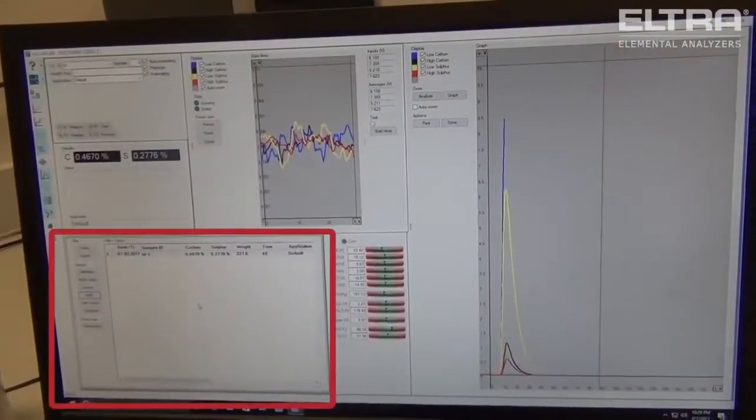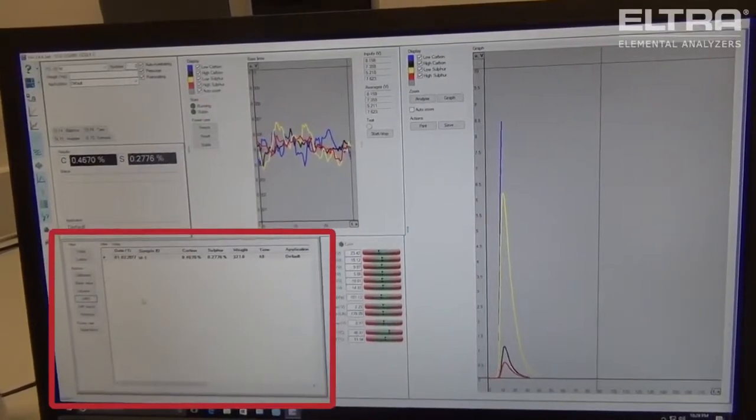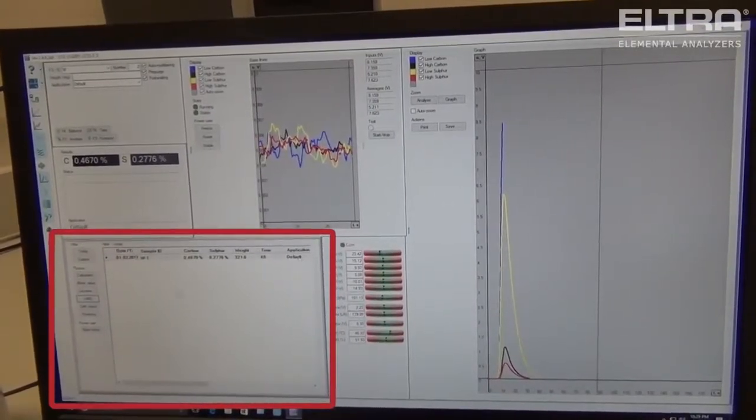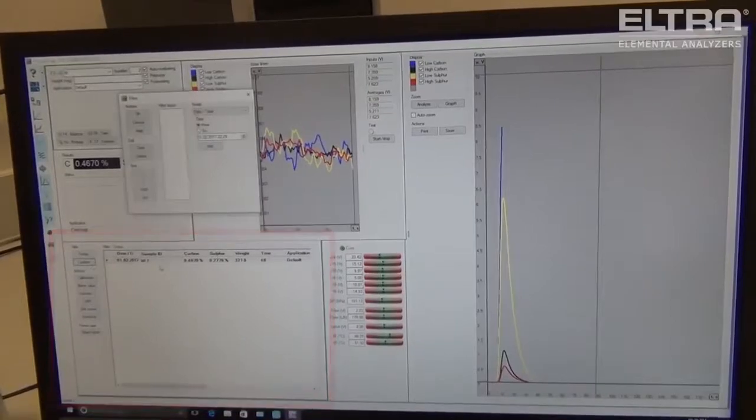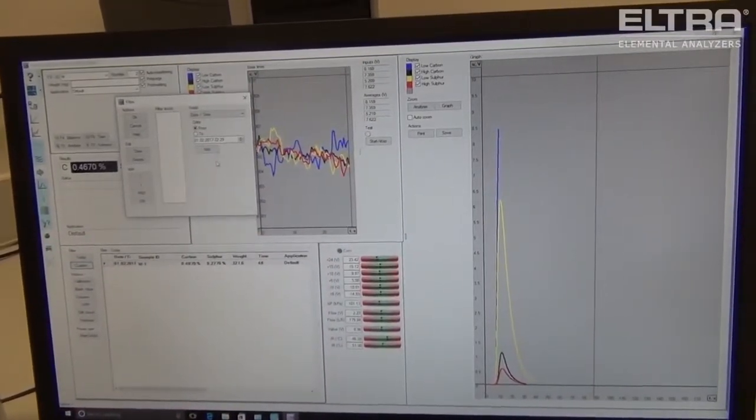Here we have the display for the results run throughout the analyzer's lifetime. If you want, you can look at samples that were done just for today, or you can do a custom sort and find any sample that was run from a certain date or time.